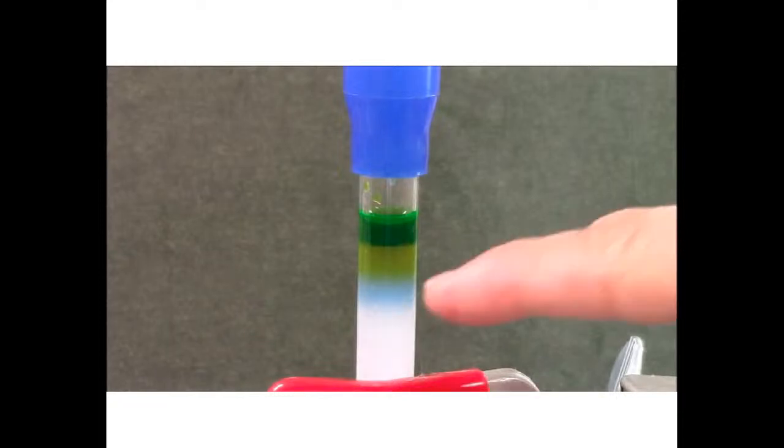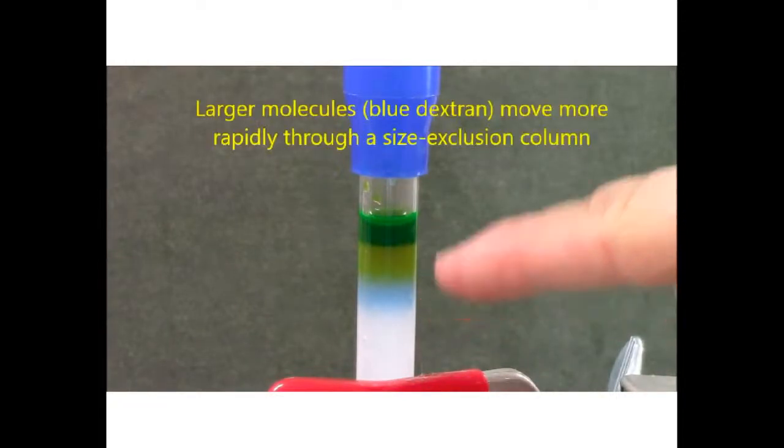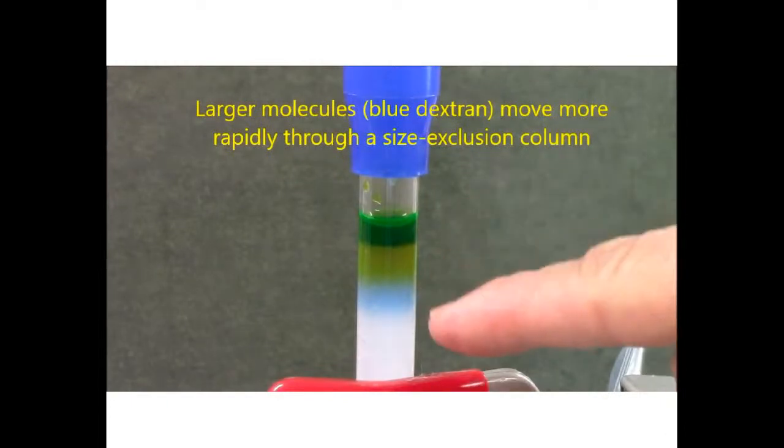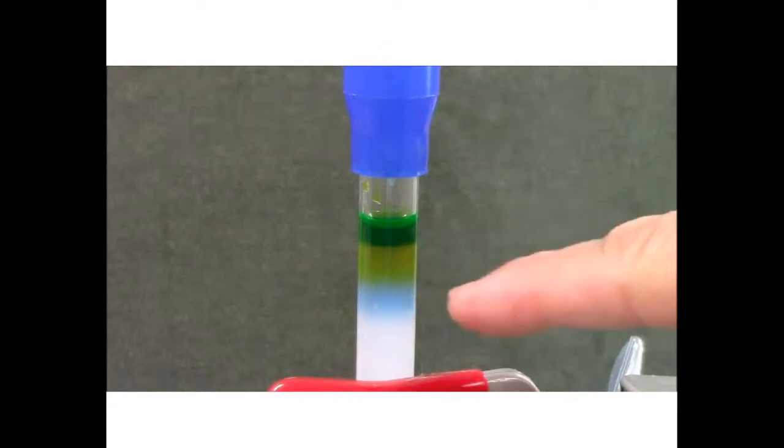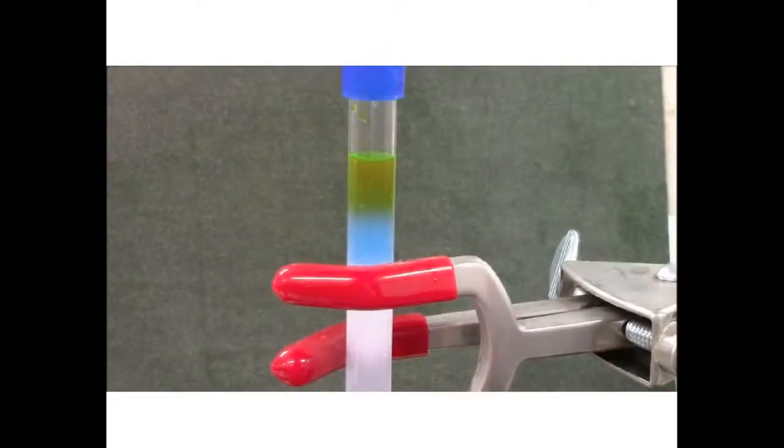So here you can see the blue molecules, the large molecules, are moving faster through the gel. I hope that I can get a complete separation between the blue and the yellow. Now the excess on the top of the gel is all soaked in. So I'm adding buffer very carefully to the top of my gel filtration column.